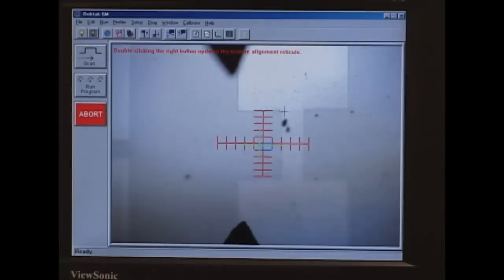The sample that we're using is a calibration standard. And this height here is what we're measuring. So we want to set up the stylus so that it's going to go across our sample. The stylus is up right now a little bit off of the sample so that it doesn't scratch or damage the stylus. But it's going to come down right about in the middle of these crosshairs. So that's how we can line up our sample.